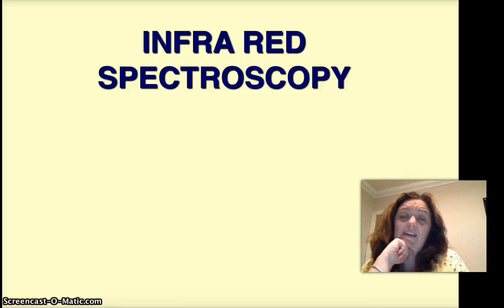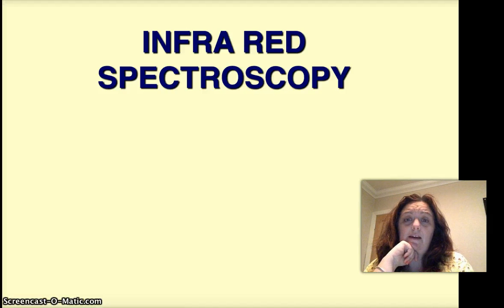Infrared spectroscopy. This is an introduction to infrared spectroscopy, where I'm just going to introduce you to the technique, how it works and why it works, and look at some basic molecules, how they are analysed and what they look like in terms of the spectra.